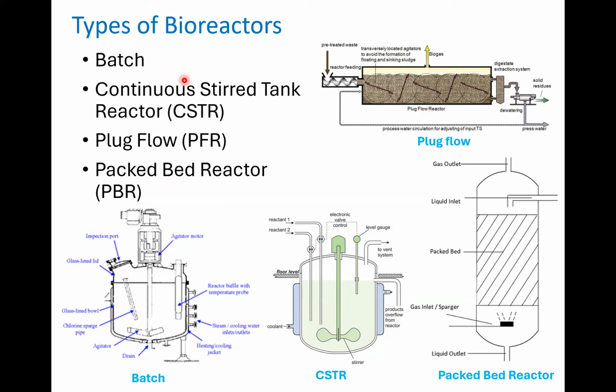If you have a batch, it means that you have a container, or a vessel, or a flask, or a bottle, or a real reactor that has some kind of feeding port or injection port. You can put the substrate inside and the reaction happens, and after some time you can terminate everything and decant at once.